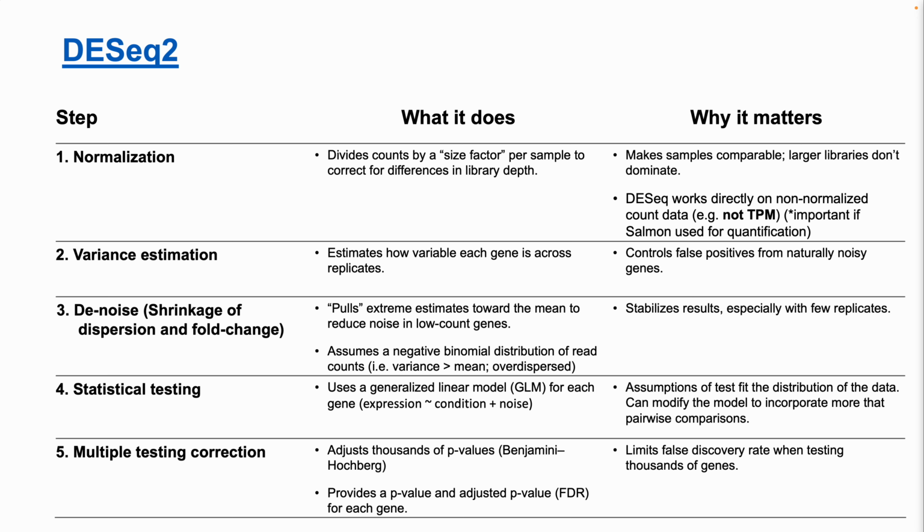That level of noise plus the random sampling by the reads, what I was talking about, the bag pulling, adds noise. That combination of things adding variance has been shown to improve the testing if you use a denoising step, essentially.